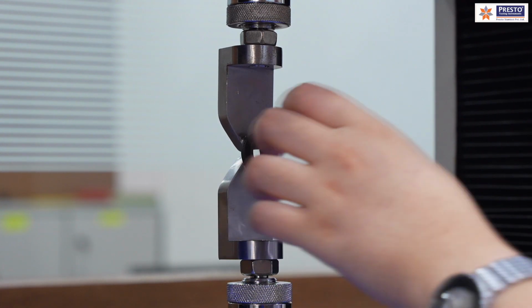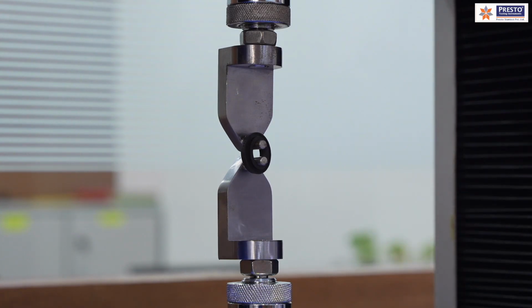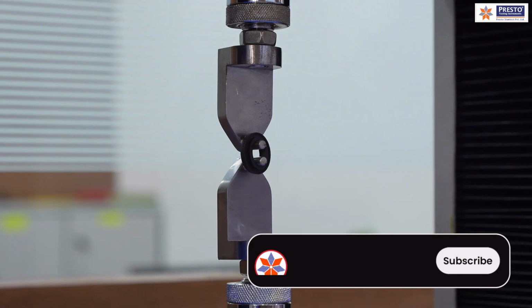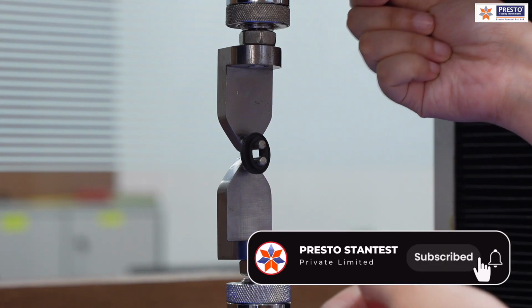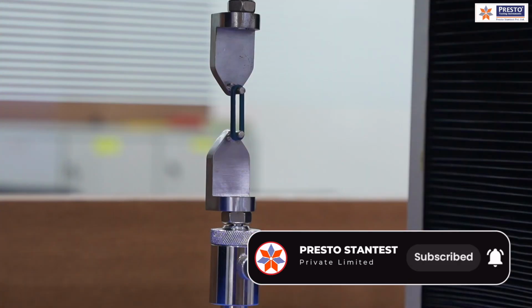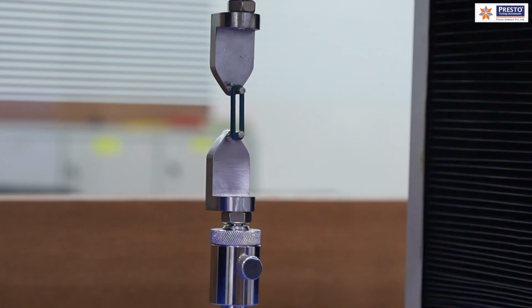You will see different kinds of testing, and one such test is the tension set test, in which we have to elongate the sample to 100%, and the machine should be capable of holding the sample for a fixed duration of time. In the standard that time is written as 10 minutes.